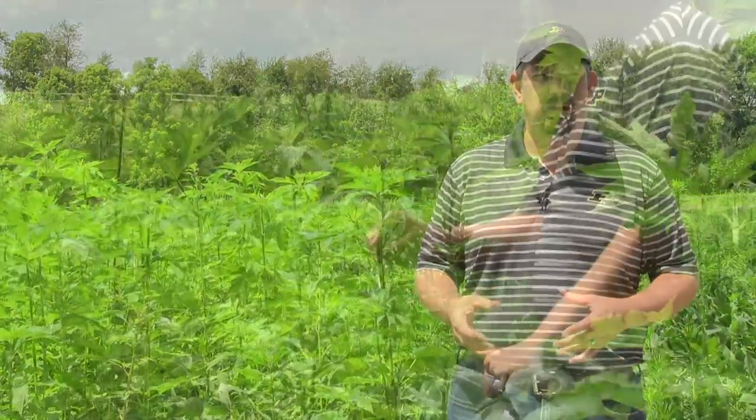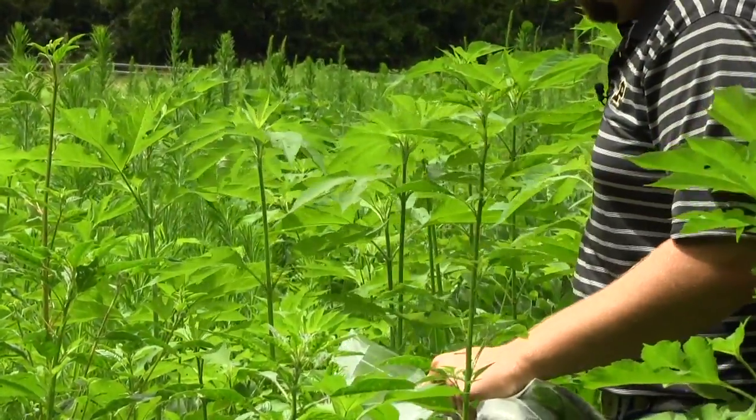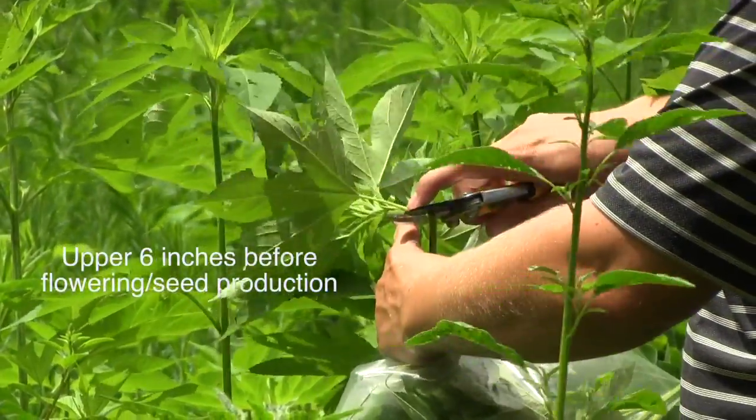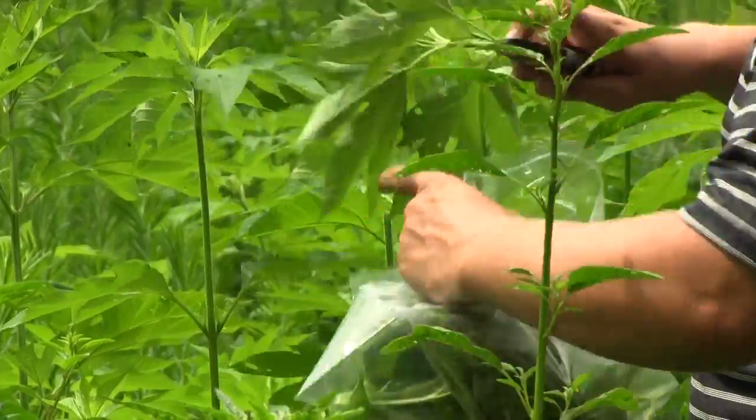The first thing is to make sure that we're sampling from the top six inches of the plant — the newest growth. This is the area where our lab is best able to extract the genetic material they need to do the testing.